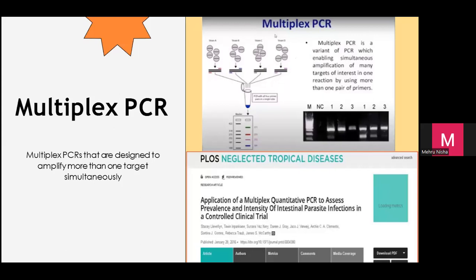As they have used multiplex PCR untuk intestinal parasite infection in a control trial. Okay, that means let's say dia pergi ke perkampungan ni, dia ambil najis 5 pelajar. 5 pelajar ni I nak detect, sebab saya nak save masa kan. So I nak detect trichuris, ascaris, hookworm, giardia dalam satu botol ni. So apa I will do, I kena bubuh 5 jenis primer. 5 primer. So dalam satu kolom ni dia boleh detect, oh at one shot lah, tak payah buat separate.